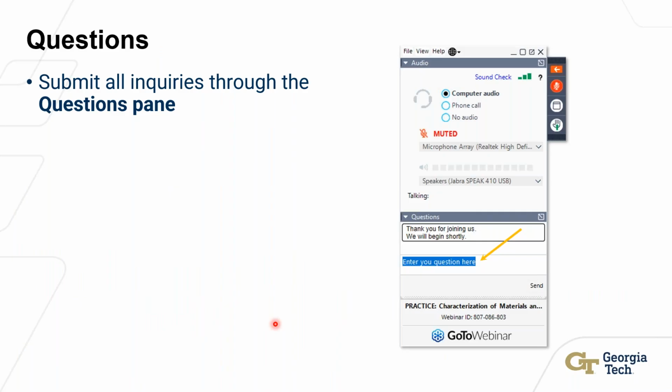Let's see. It's just running on a standard desktop computer. I think that the NLPAR processing, for those nickel or gold scans I was showing, probably takes 5 or 10 minutes. And then processing the orientation maps takes another 5 or 10 minutes. So it's really not much of a limiting factor. We're looking at 10, 20 minutes of time to go from the raw data to your orientation maps. Okay, nice.